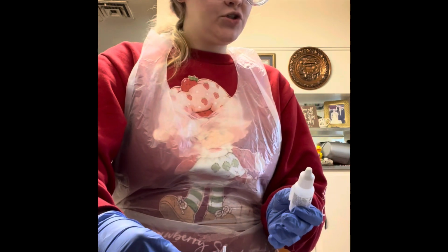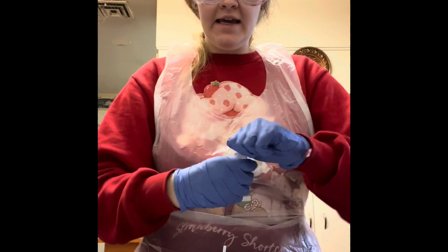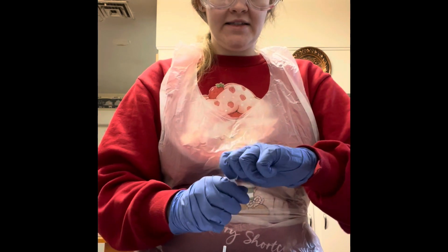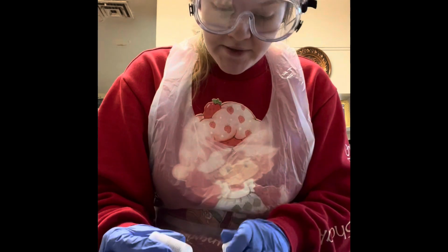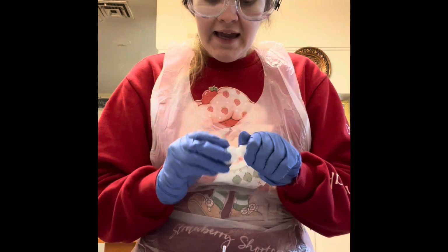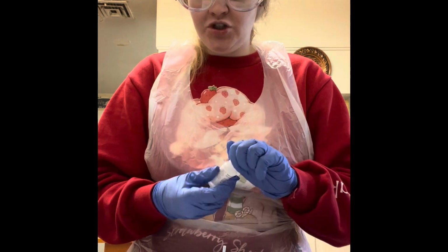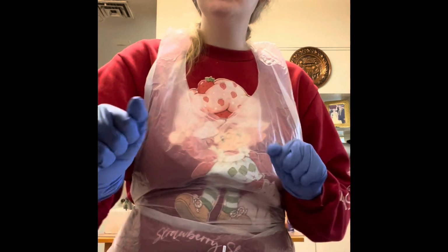And now it says to add 4 drops of my hydrochloric acid in with my potassium chromate. And that'll be, yes, 4 drops. 1, 2, 3, 4. Oh, it's turning orange. I think that I have to put that into my information, so I'm going to put orange.